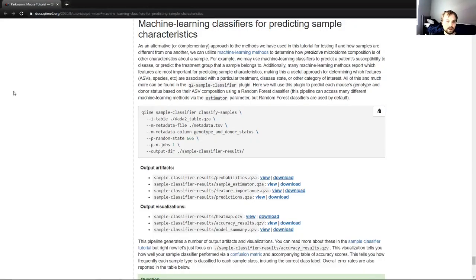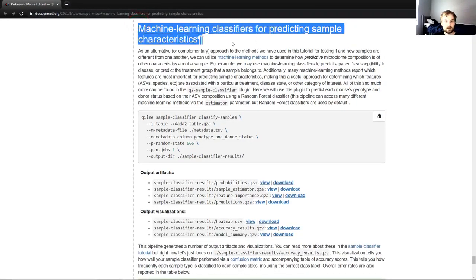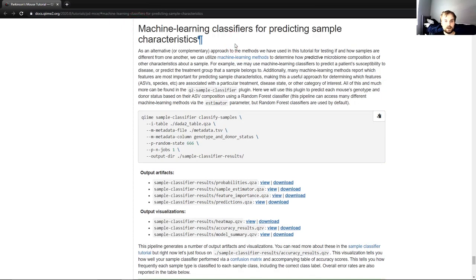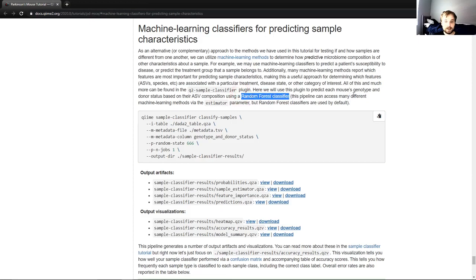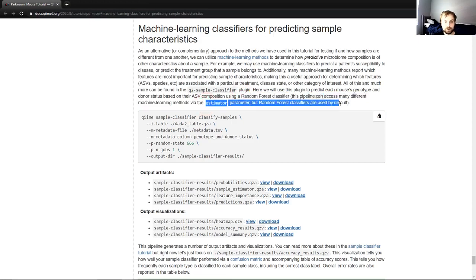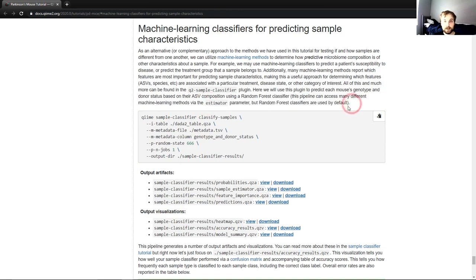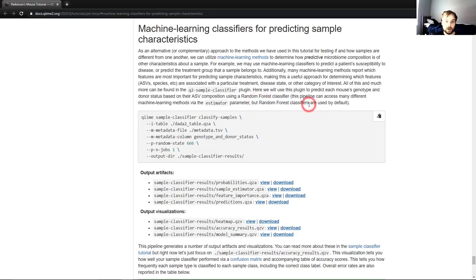So looking at the tutorial itself, machine learning classifiers for predicting sample characteristics. We will be using machine learning classifiers not to assign TAXA to our ASVs like we did previously, but to attempt to predict different characteristics about our samples based on different metadata columns that we have. And we will be using a random forest classifier. This pipeline can access many different machine learning methods via the estimator parameter, but random forest classifiers are used by default.